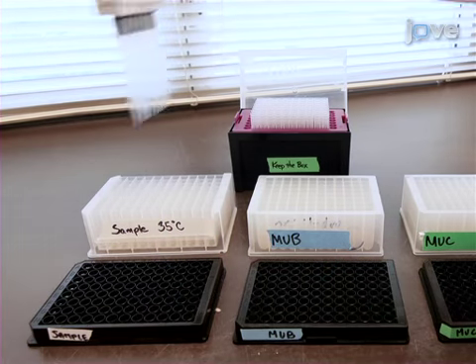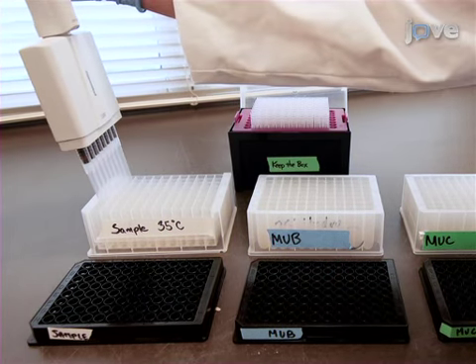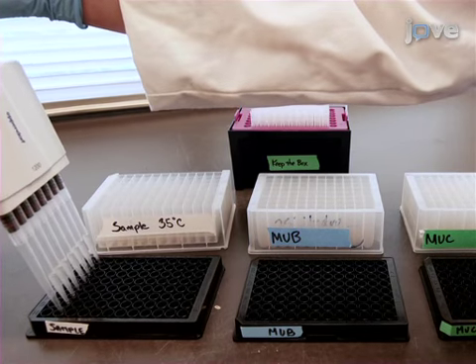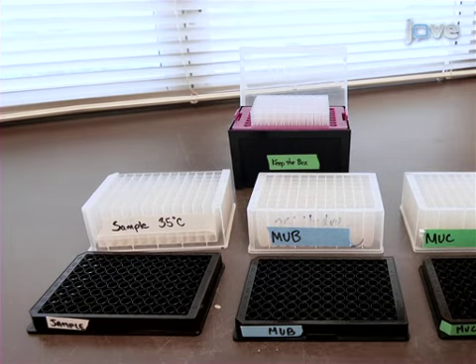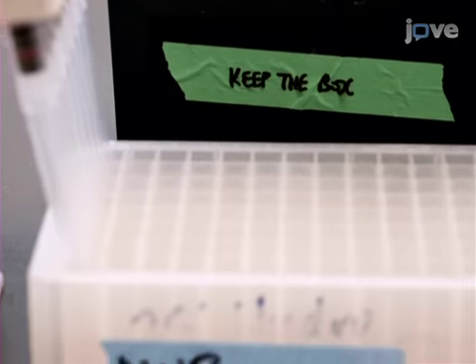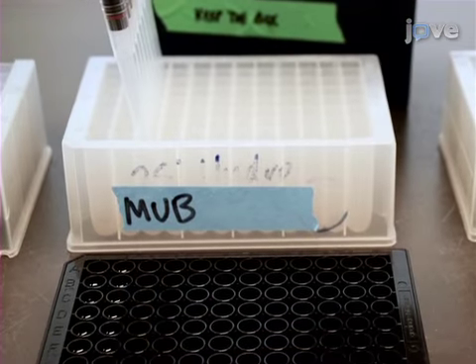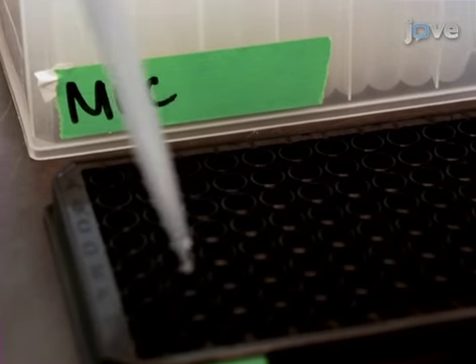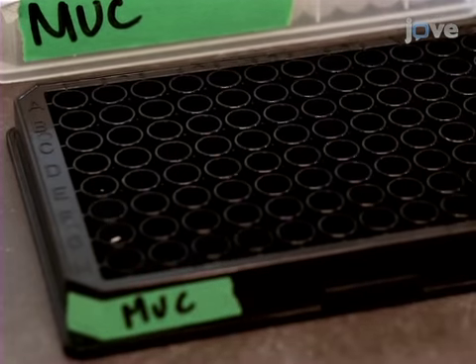After centrifugation, transfer 250 microliters from each well of the incubated deep well plates into the corresponding wells of black, flat-bottomed 96 well plates. 1 black plate will be used for each incubated deep well plate. It is important to transfer samples from the incubated deep well plates into the corresponding wells in the black, flat-bottomed 96 well plates.